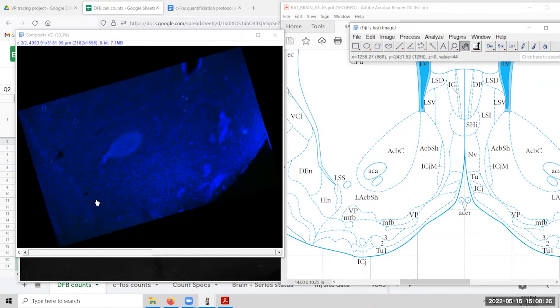in order to create a cutoff for what we end up dumping from the image. So what I'm going to use now is the polygon select tool. This is basically the more complicated aspect of the counting process. If a region were able to be boxed in a very clean square or a circle or oval shape, I really recommend doing that instead of the polygon select tool, because you have a lot more control over that. In this case, we're going to have to figure out where things are based on a little bit of Nissl staining and a little bit of the edges that we do see in the image.